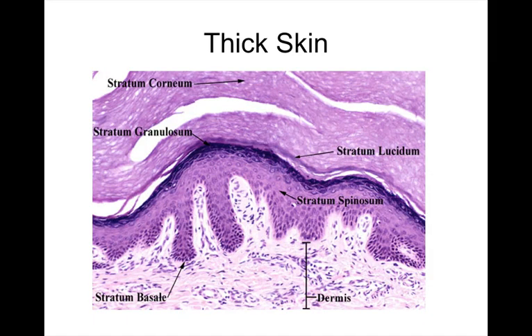Okay, good. So some skin. This is labeled, but that's okay. Now, all right, good. So let's walk me through this. This slide shows the layers of the skin. So you start on the apical layer, which is the stratum corneum, and that's about 20 to 30 cell layers thick. And this slide actually shows the stratum lucidum, which is only seen in thick skin.